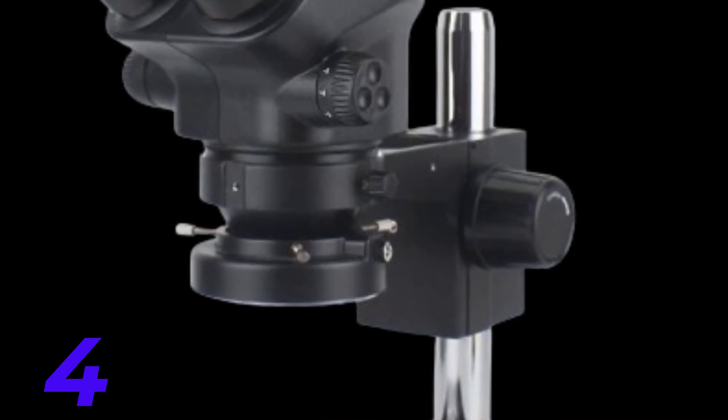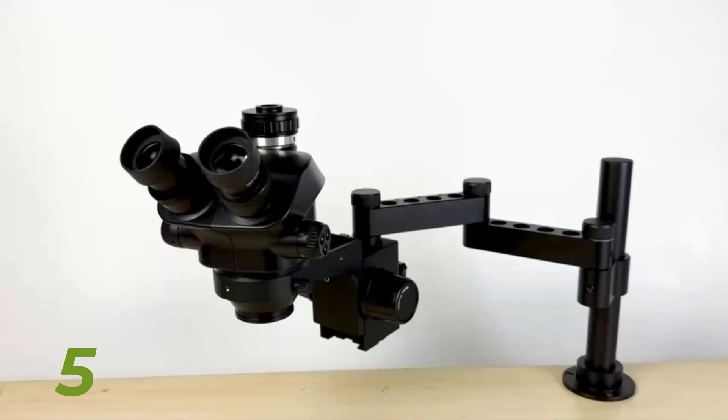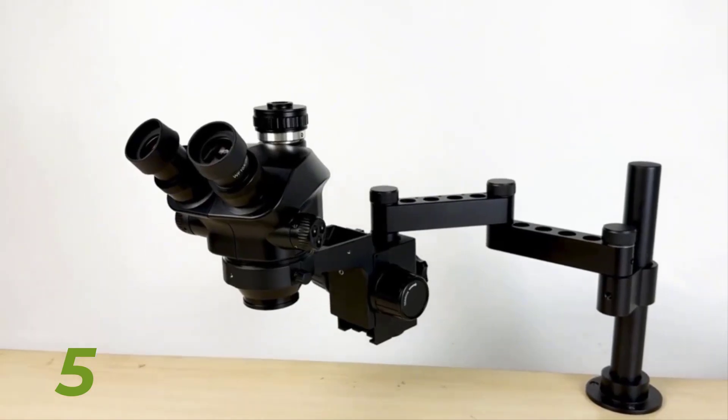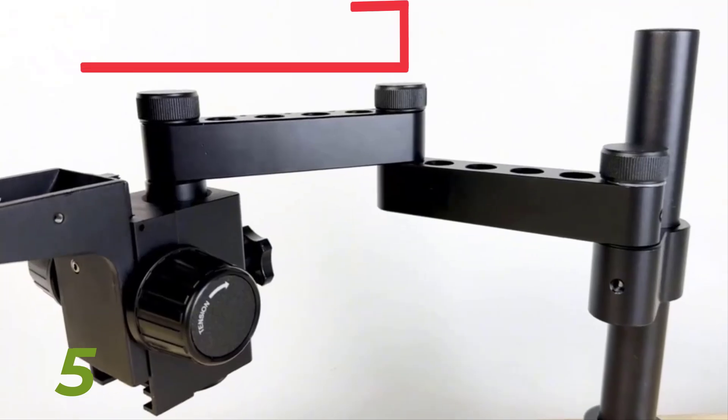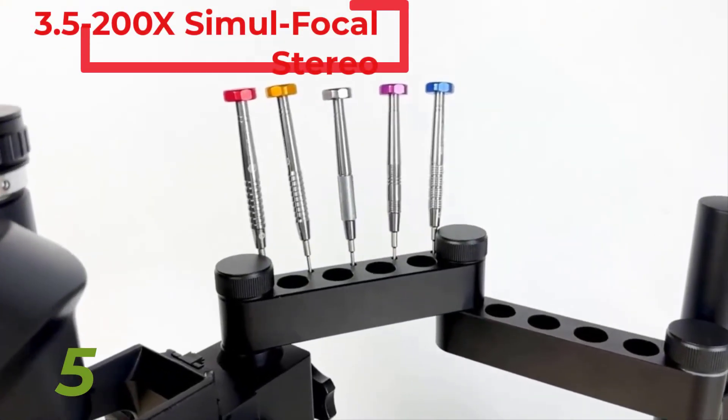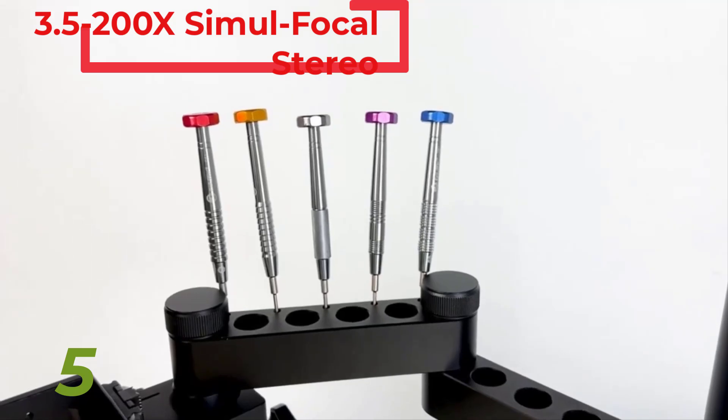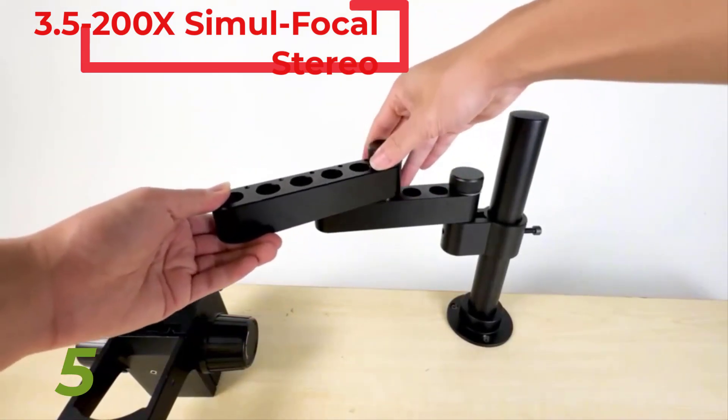The trinocular head allows for simultaneous viewing through the eyepieces and the camera, providing a seamless experience for both observation and documentation. This feature is particularly useful in collaborative settings or when recording observations for later analysis.